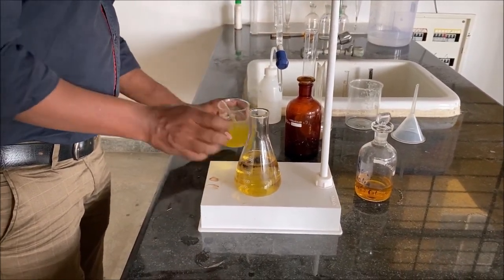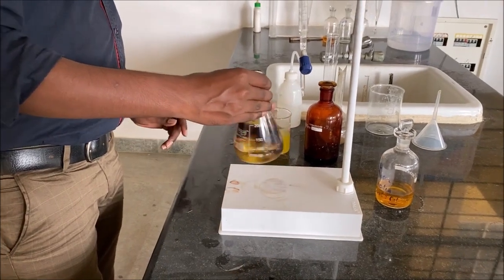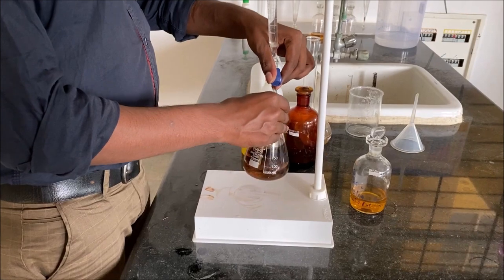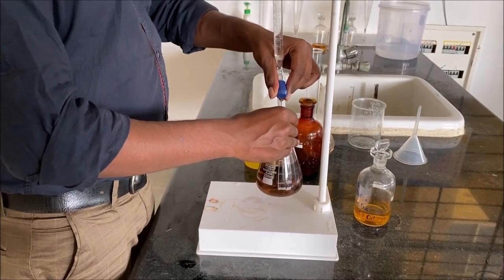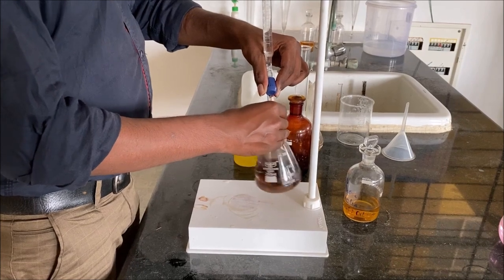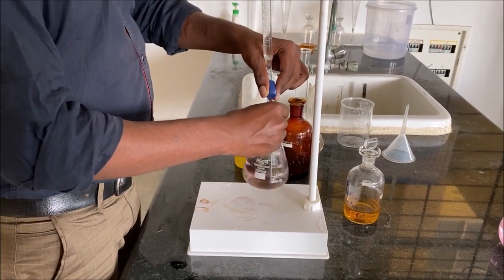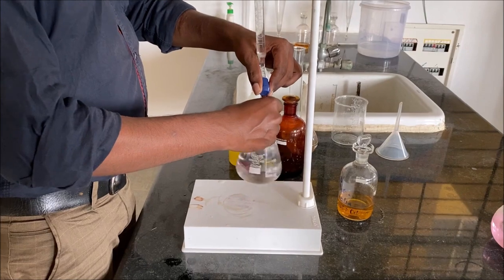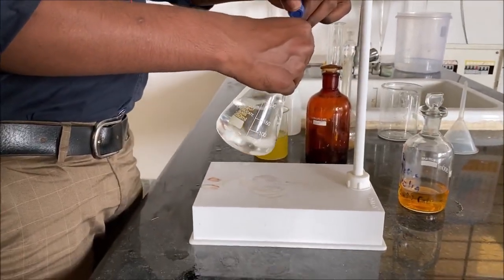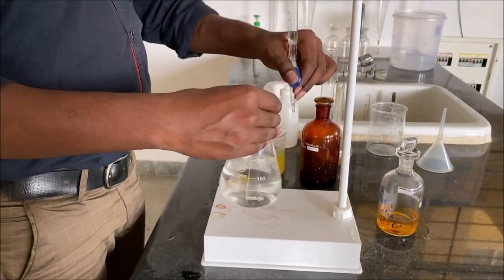So we can witness the solution turning dark blue. Now the solution is titrated against standard sodium thiosulfate solution until the dark blue color vanishes and the solution becomes colorless. So it is easily visible that the solution has turned colorless.